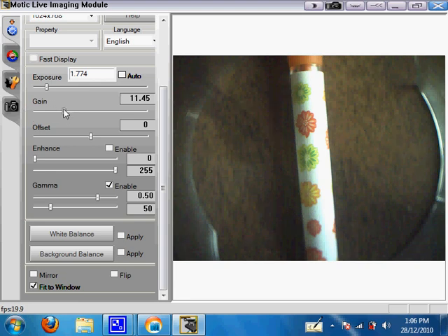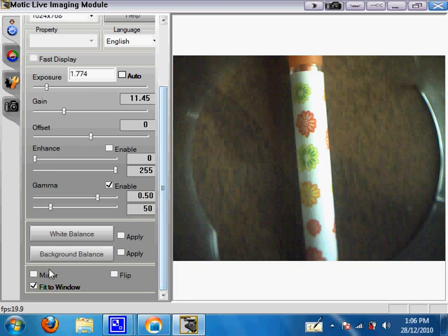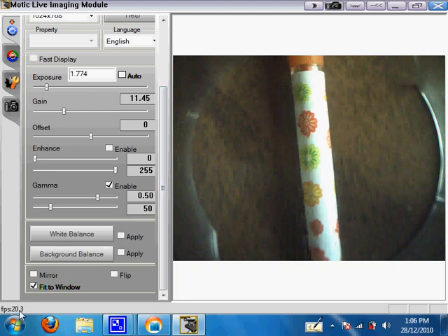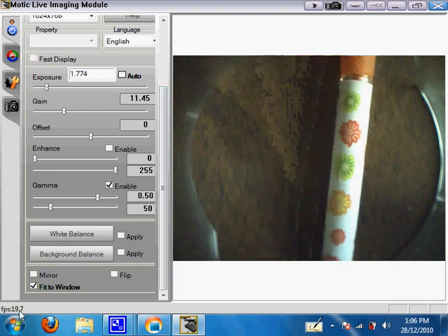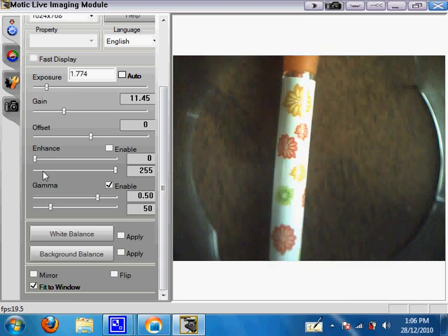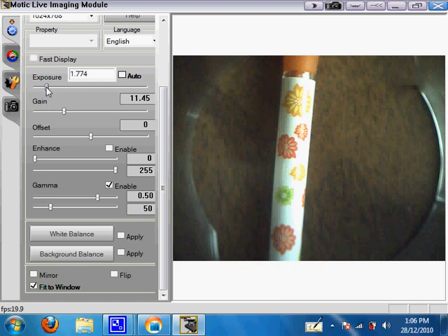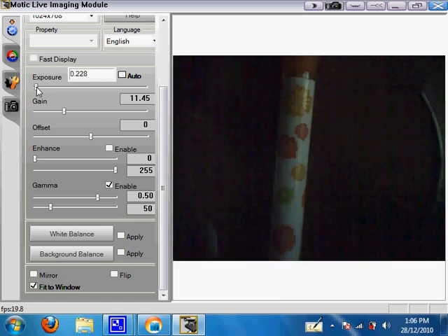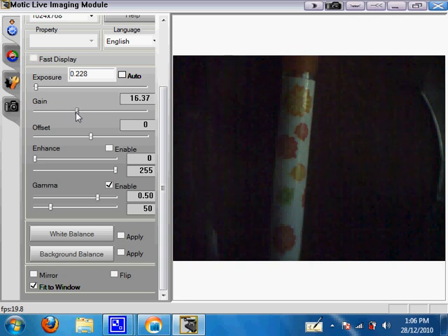You can adjust in general to get a high frames per second which is 19 right now so as you can see, it's a very smooth video is to have a low exposure and you can adjust compensate for the low exposure because it gets darker by a high gain.